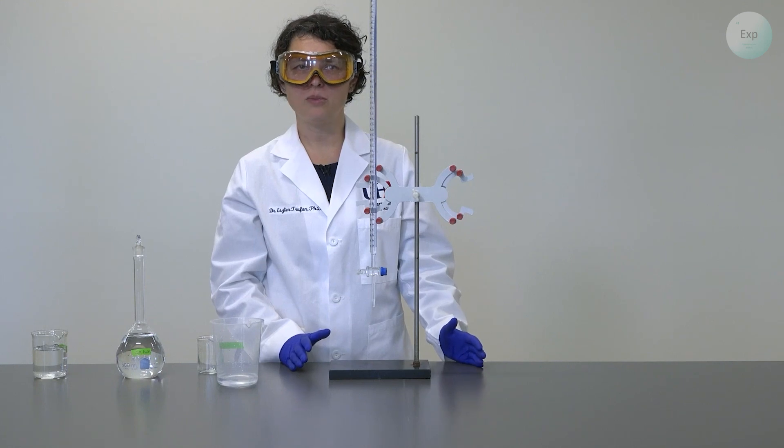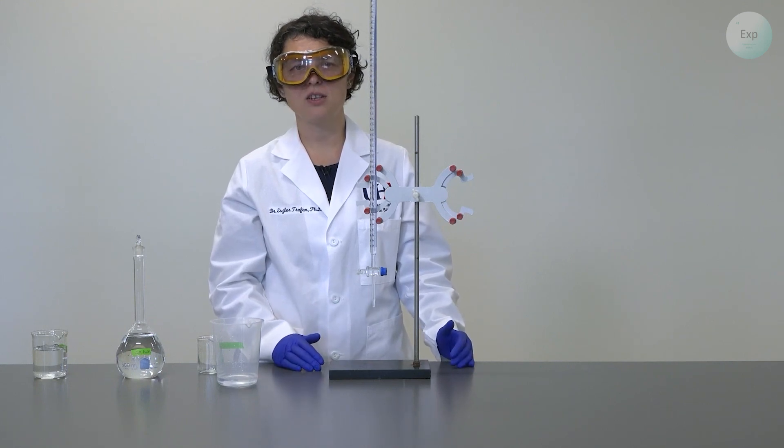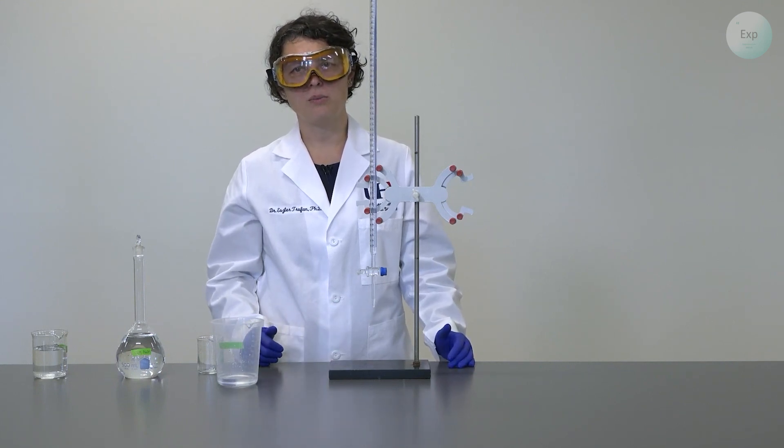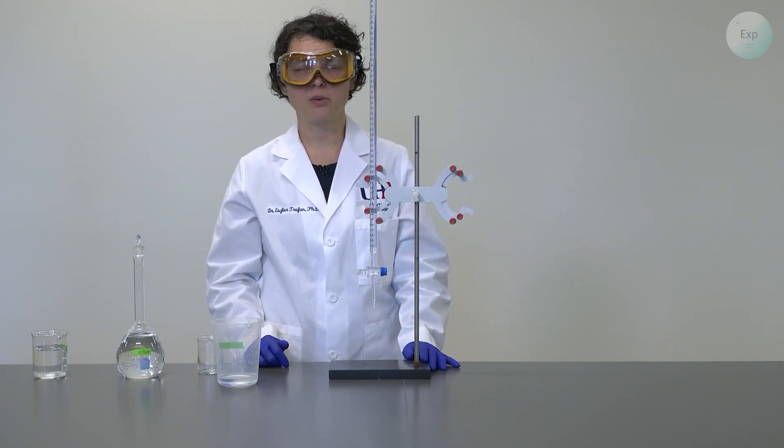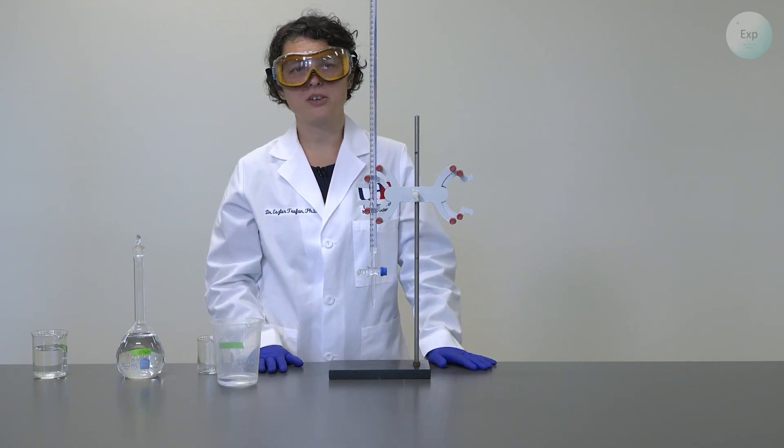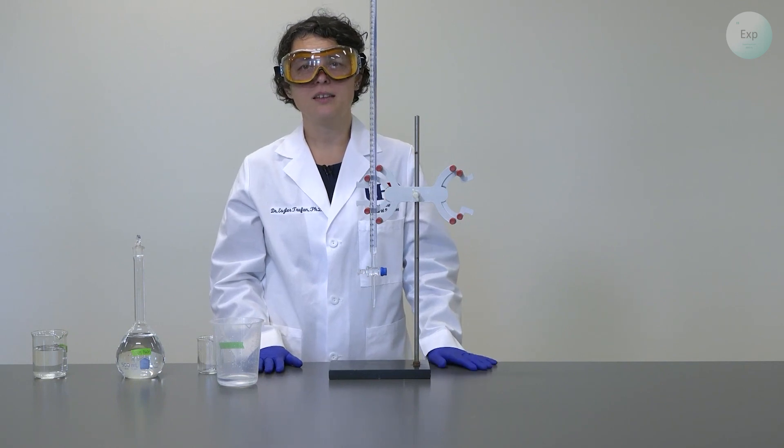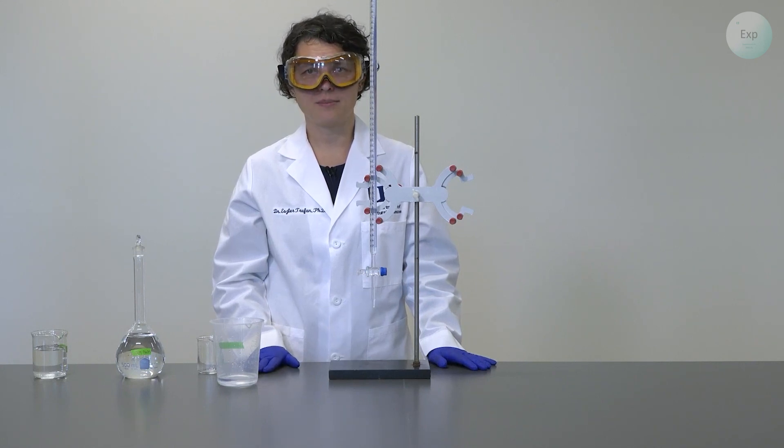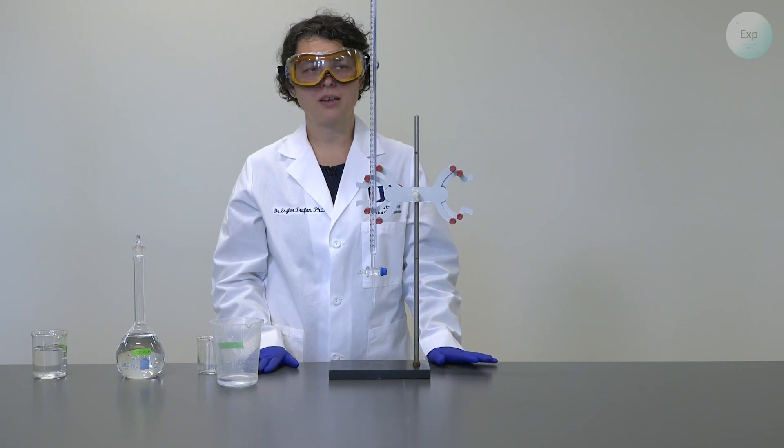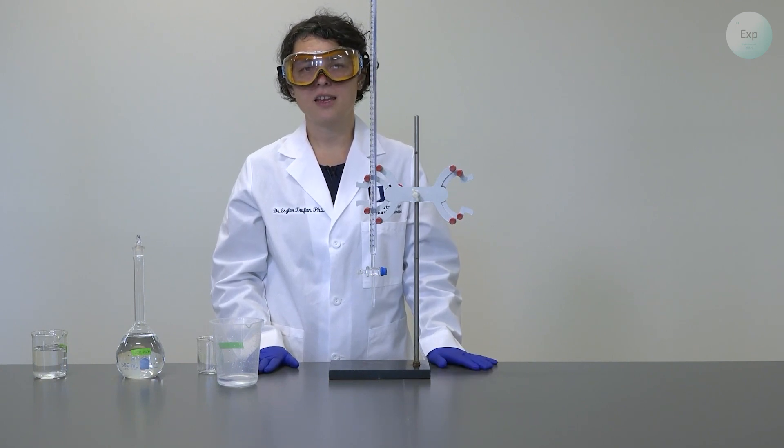This is the volume that we read at the beginning of the titration. And then we monitor the volume that is added throughout the experiment. So to record the volume, we're going to use a very similar technique to what we used with the 10 milliliter graduated cylinder. We are going to have two numbers after the decimal place. The second number will be our estimate.